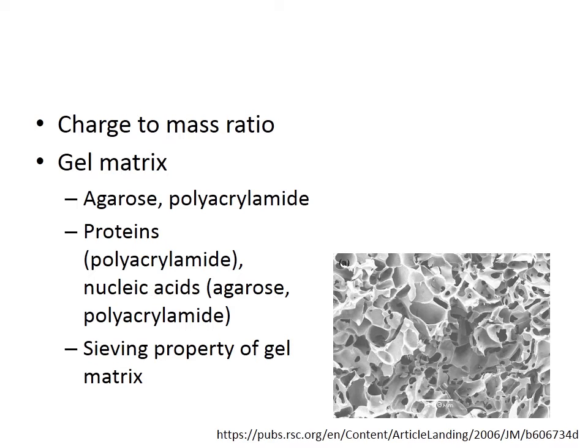Gel concentration is one important factor for determining the pore size. When the concentration of the gel is more, the pore size is smaller. So the pore size of the gel is inversely proportional to the concentration. A gel having higher concentration will have a low pore size, and hence the migration rate will be low. As opposed to this, a gel having low concentration will have larger pore size, and hence the migration rate of molecules in that gel would also be high.